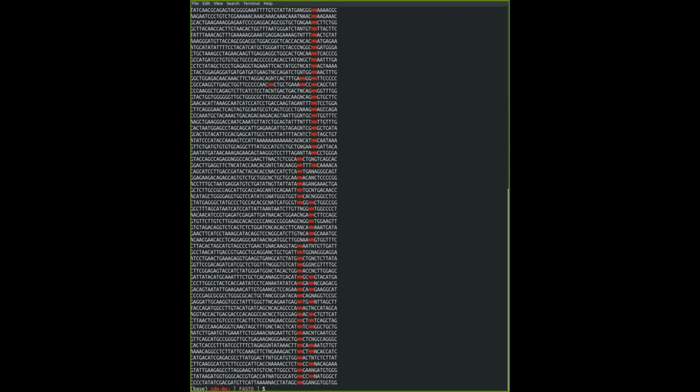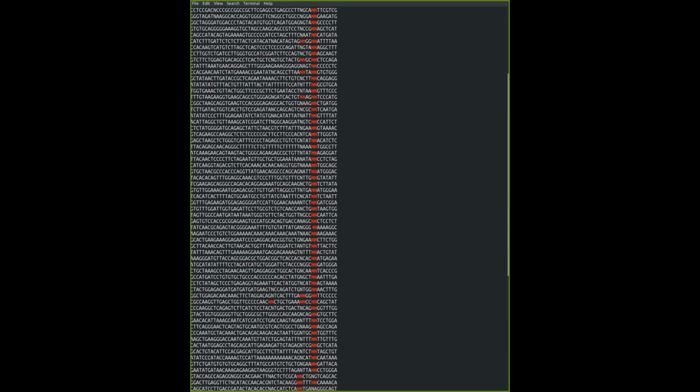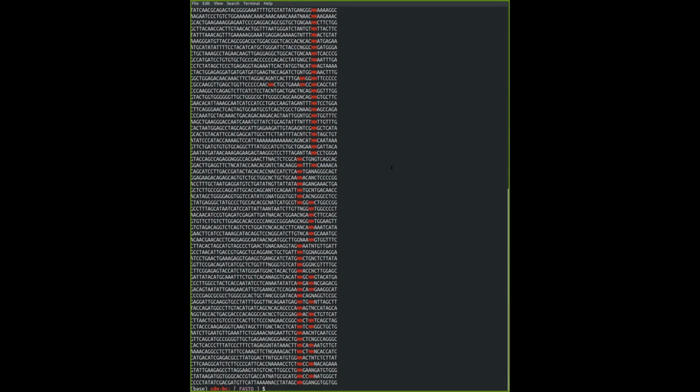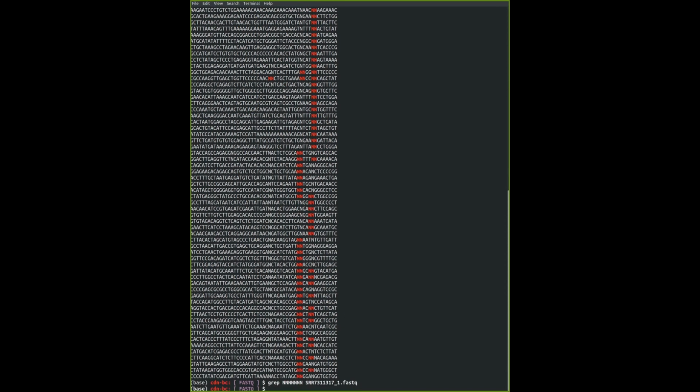So you're going to search for this, and you can see not too big of a list. All the sequences that contain these N doublets. It's not a lot. I did try inputting, let's say, a couple more N's and searching for this, and it does come up with nothing, which is a good sign. It means that the sequencing is good and there's no stretch of miscalls. And if you see a stretch of miscalls, it usually means a very poor quality read.